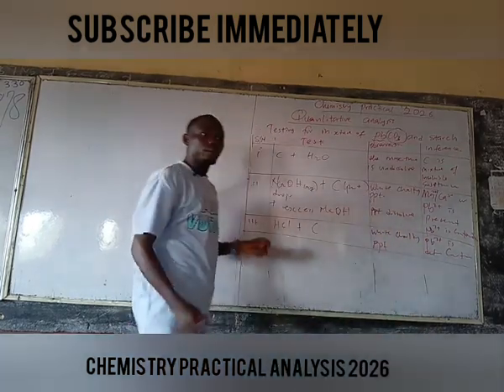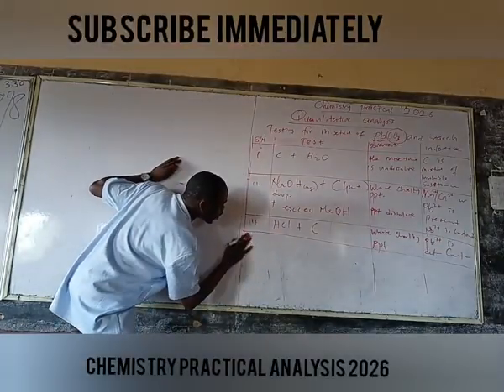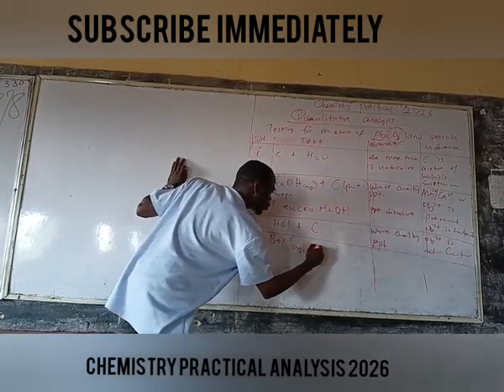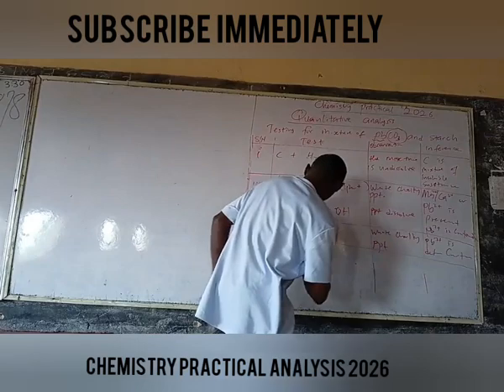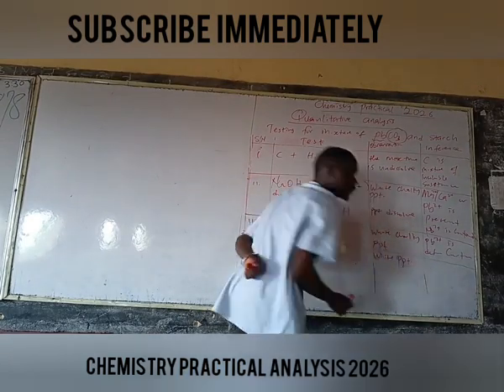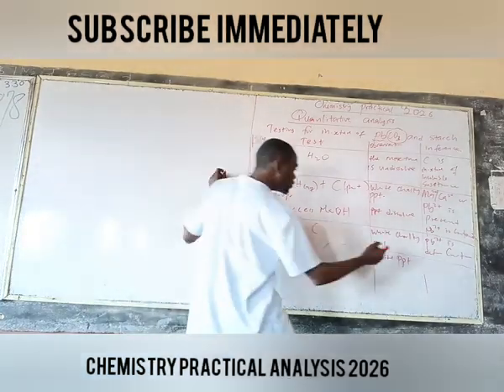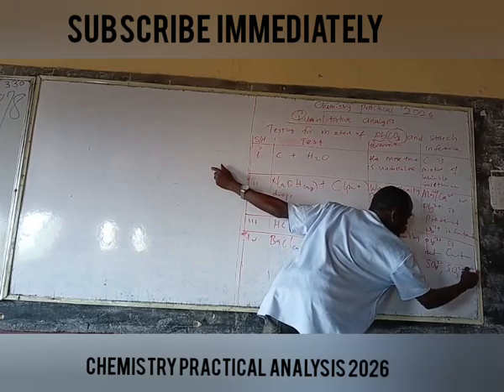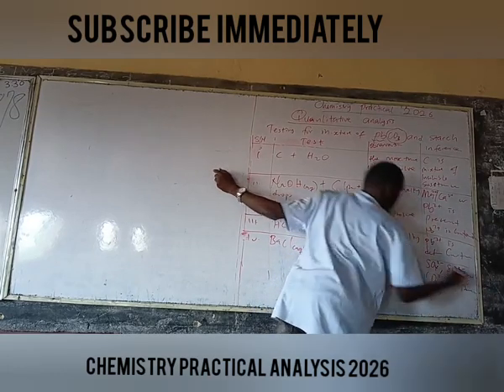How do we confirm carbonate? Carbonate is confirmed by adding barium chloride. We use barium chloride aqueous solution plus that solution C, and we get a white precipitate. So when you see a white precipitate, what do we infer? We infer that SO4 2 minus, SO3 2 minus, or CO3 2 minus is present.